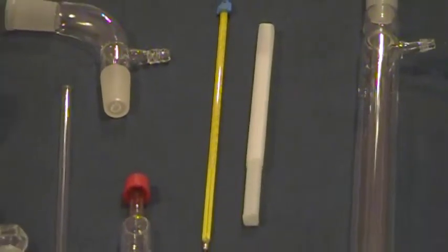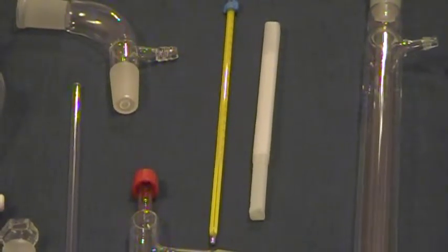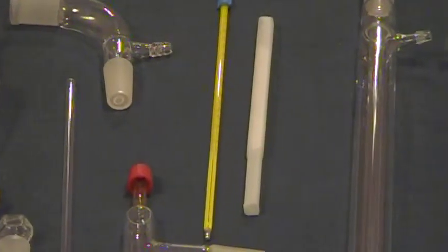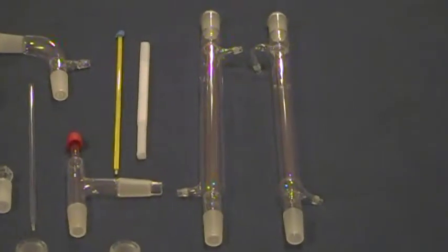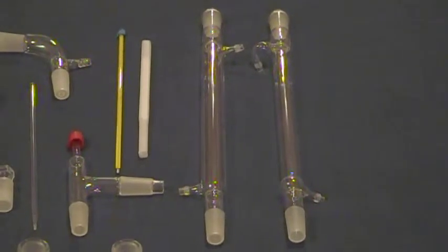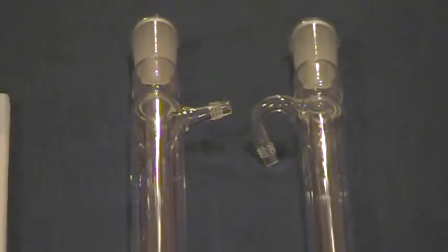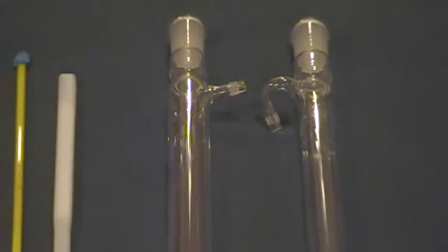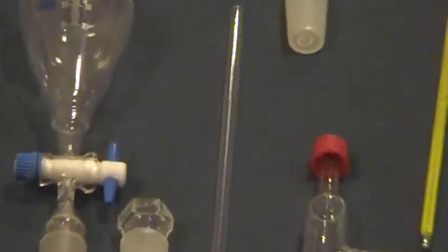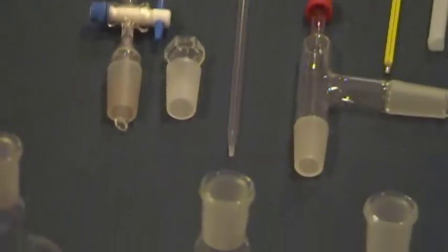Also included is a glass mercury thermometer with plastic case that measures from minus 10°C to 300°C. This kit comes with two condenser types: a Liebig and a West condenser, both 300mm in size. Additionally, there is a 7mm wide glass vent tube.